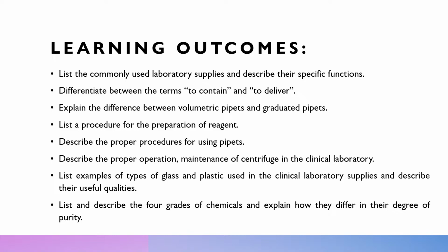Also, explain the difference between volumetric pipettes and graduated pipettes. Have a list of a procedure for the preparation of reagents. Describe the proper procedures in order to use your pipettes. Describe the proper operation and maintenance of the centrifuge in the clinical laboratory.